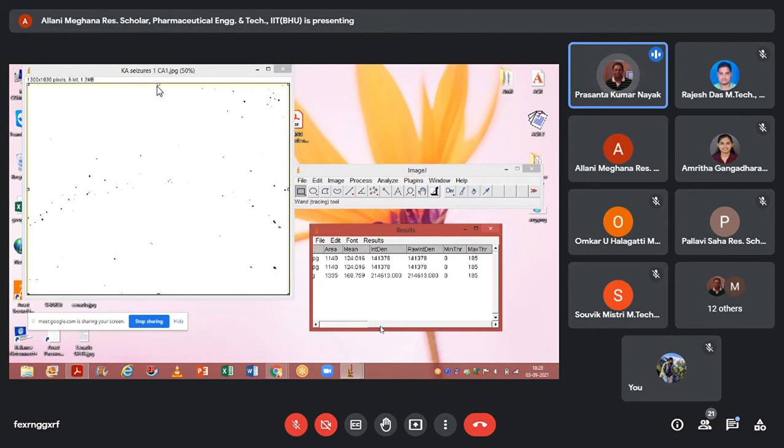If you clearly see, one thing I will show you is how a CA1 looks like. I'll just share one file. Can anybody open that first thing? Okay, let me see whether I have posted it here.